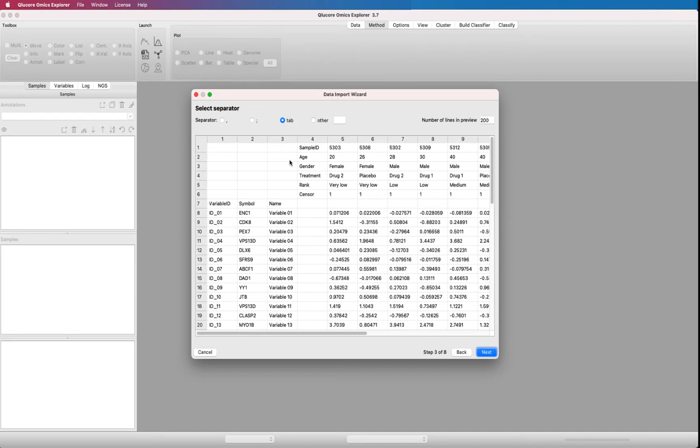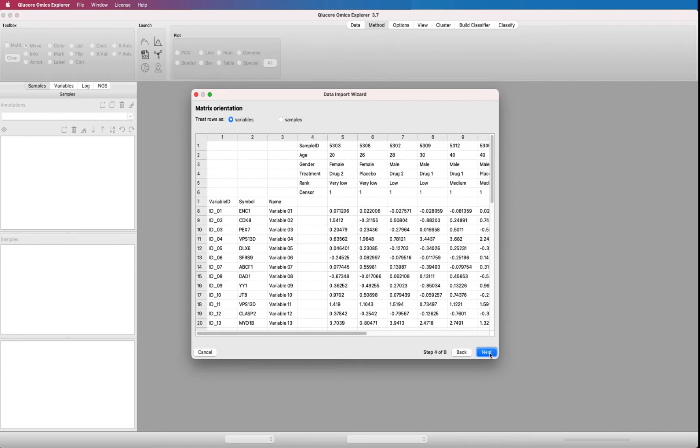Next question. Select separator. This is a tab-separated file, so this is correct. Press next. Next question. Matrix orientation. The rows are variables. This is correct. We can also handle transposed files with samples as rows. Press next.